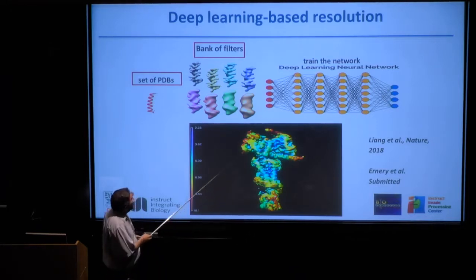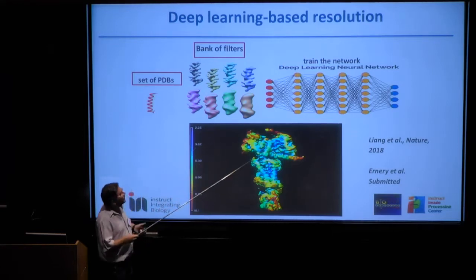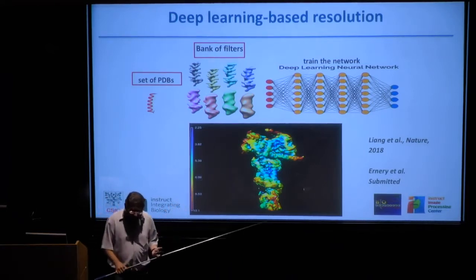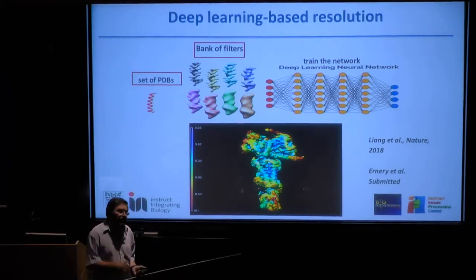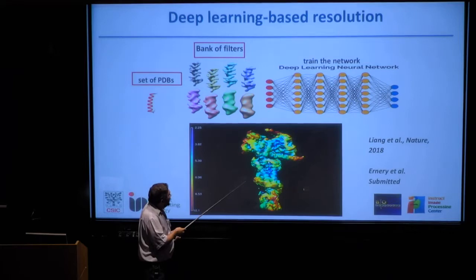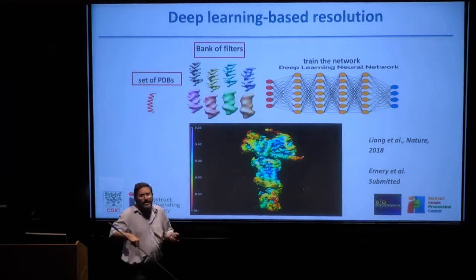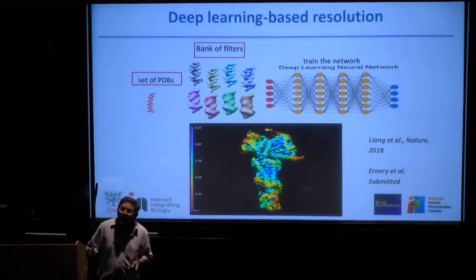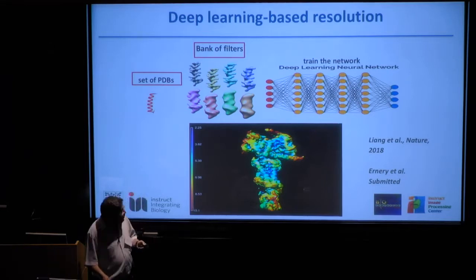So with that, if we now call it resolution by deep learning, and we color the same GPCR that we applied monoRes to before, well, we see a very similar result, and we see that really there are areas that are better resolved, there are areas that have a lower resolution, that are the same areas that we found by monoRes, ResMap, BlockRes, all of them, and we were happy.